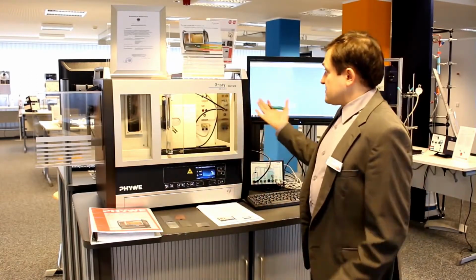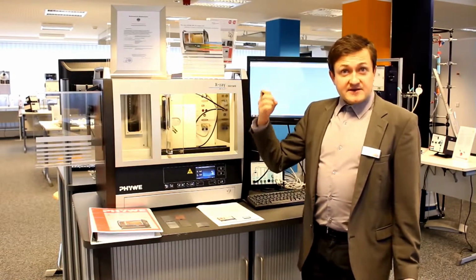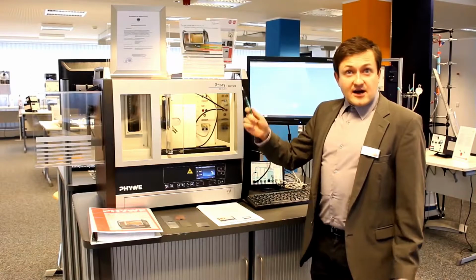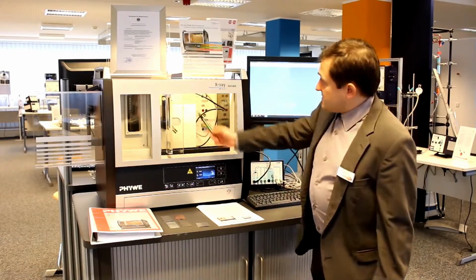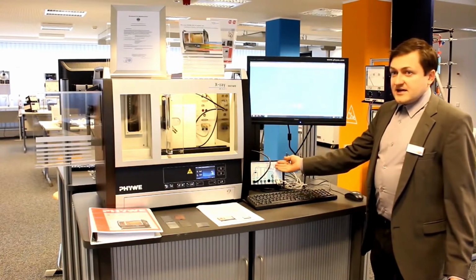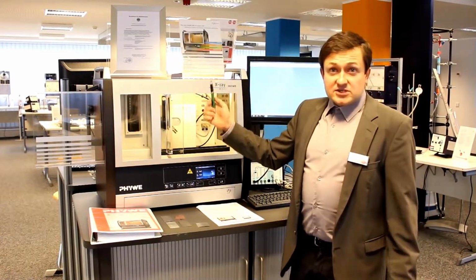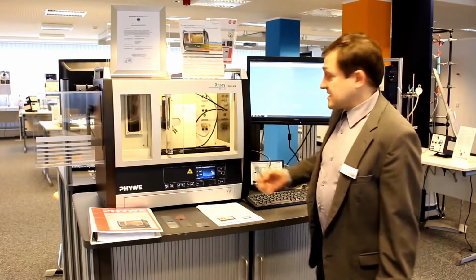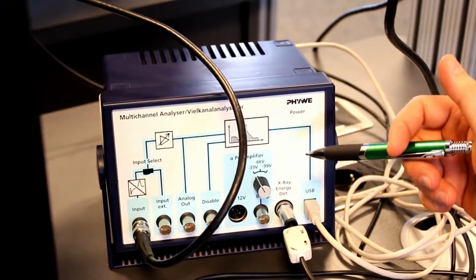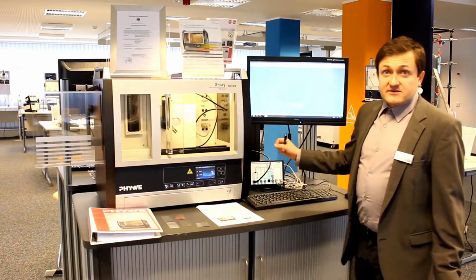To conduct the experiment, we use the fourth generation X-ray versatile teaching laboratory of the company Phywe, and we use it in a single photon counting regime. We employ for this a PIN diode and a multi-channel analyzer. The PIN diode produces electrical pulses whose amplitude is proportional to the incoming energy of the X-ray photons, and the multi-channel analyzer counts the histogram of the incoming photons and in this way produces the energy spectrum of the X-ray radiation.